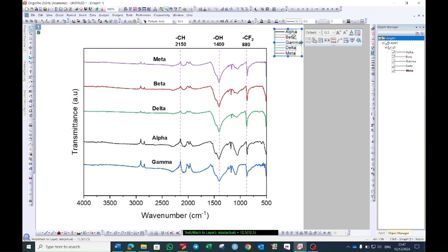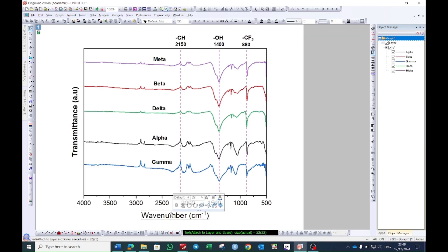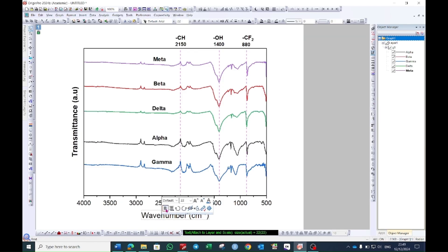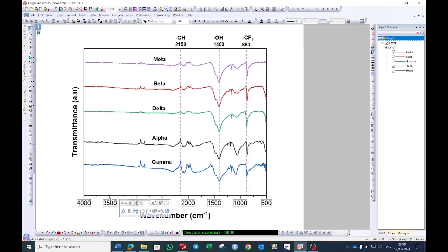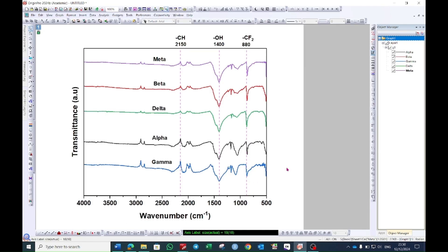Now you can delete the legend. Just select this one and then press delete. Select y axis and x axis title and make them bold and also these values. In this way your graph will be ready.